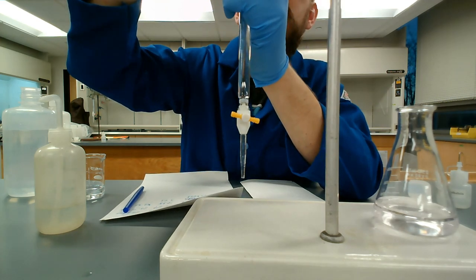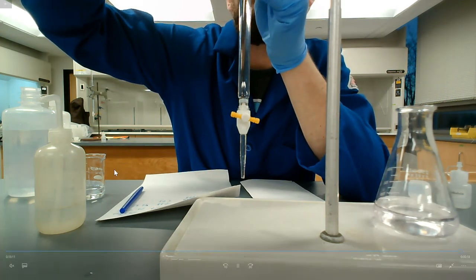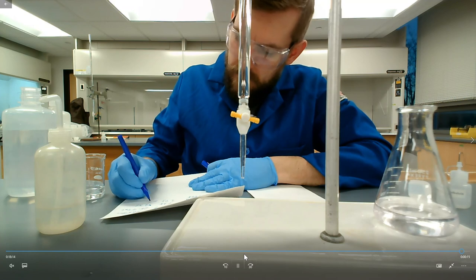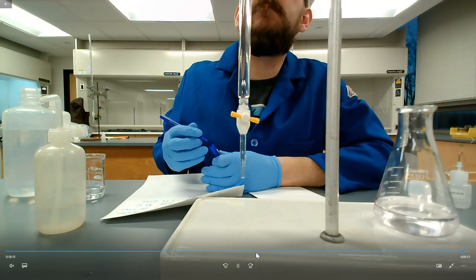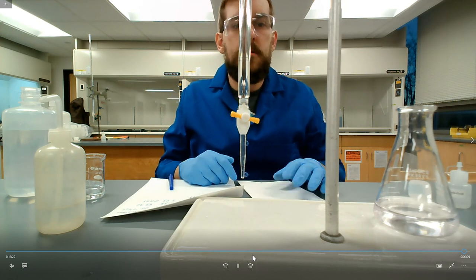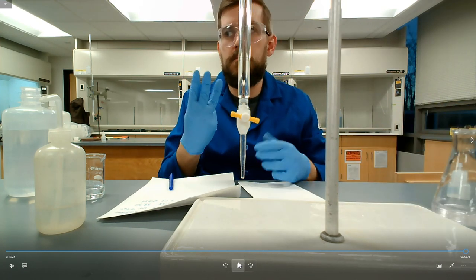I think I messed one of them up, but again, most of the stuff with a Buret has to do with setting up at the start, making sure your Buret is clean and filled with the solution that you want, right? There's another set of videos where I do the vinegar titrations if you want to check those out, but these are just to give you an idea of how I collected the data for these titrations. So.